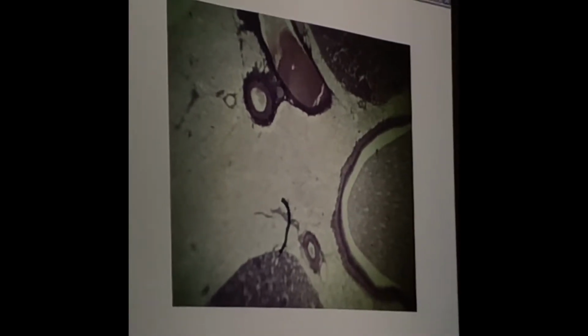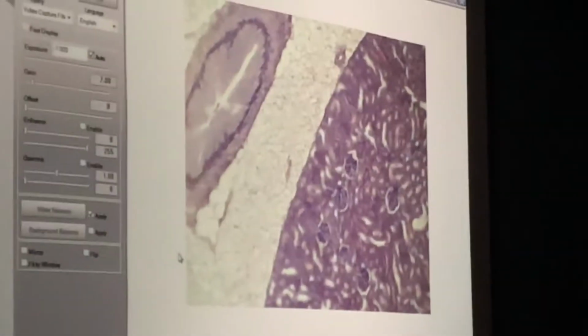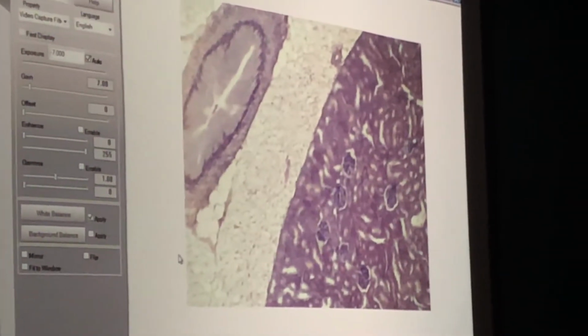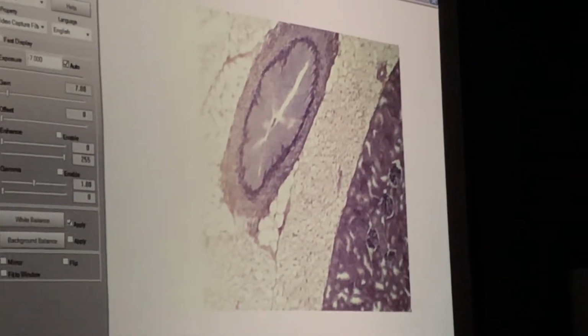We might expect to see some renal arteries and veins. Artery here or vein? Vein. This would probably be artery. Good. And then sometimes if we go out, we even get to see a little bit of a tube like this. And since we're here, let's go ahead and look at that. Okay, so I'm going to take that up to... Okay. By the way, what is all this stuff? Adipose. Okay, let's go up to the next.